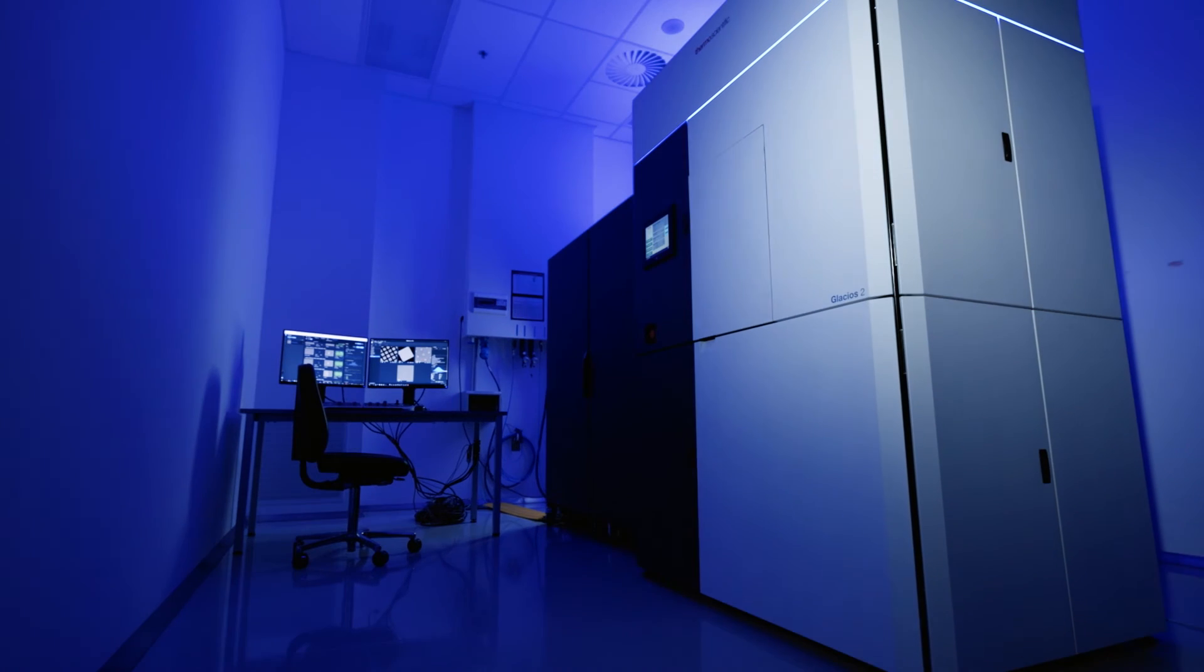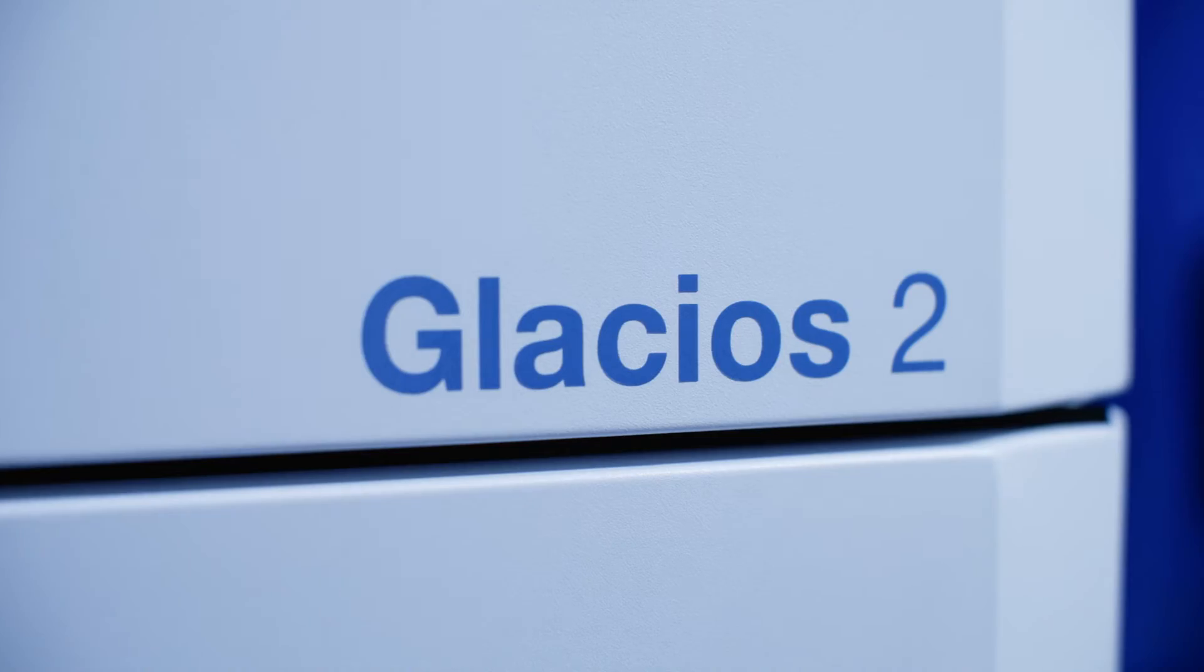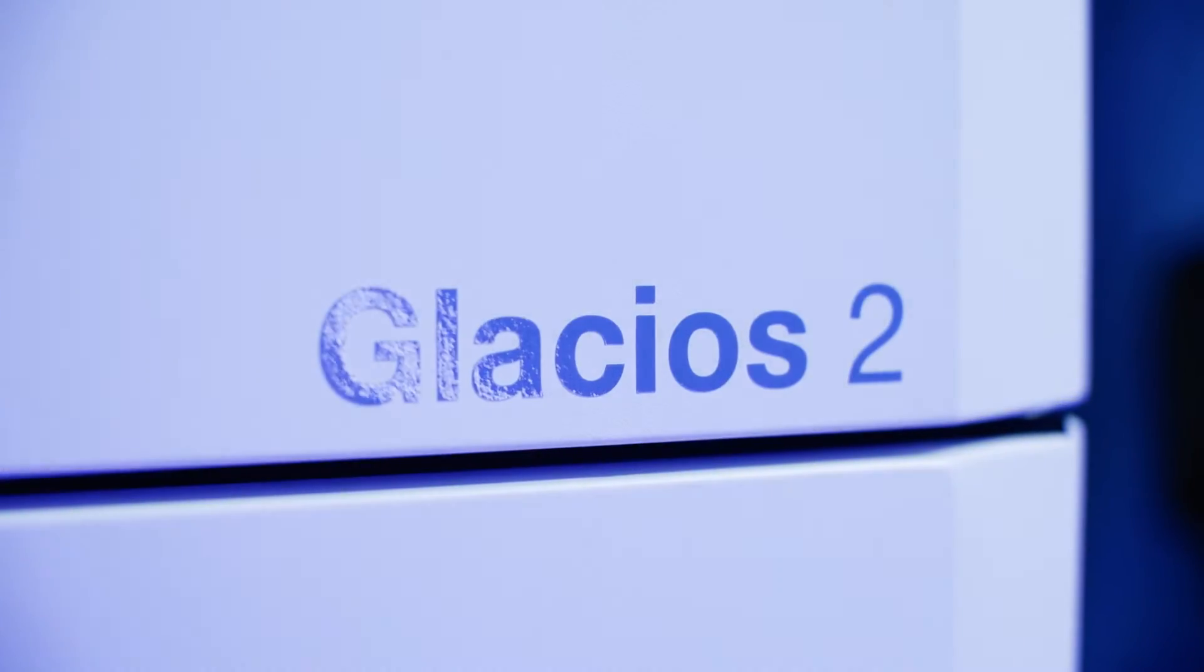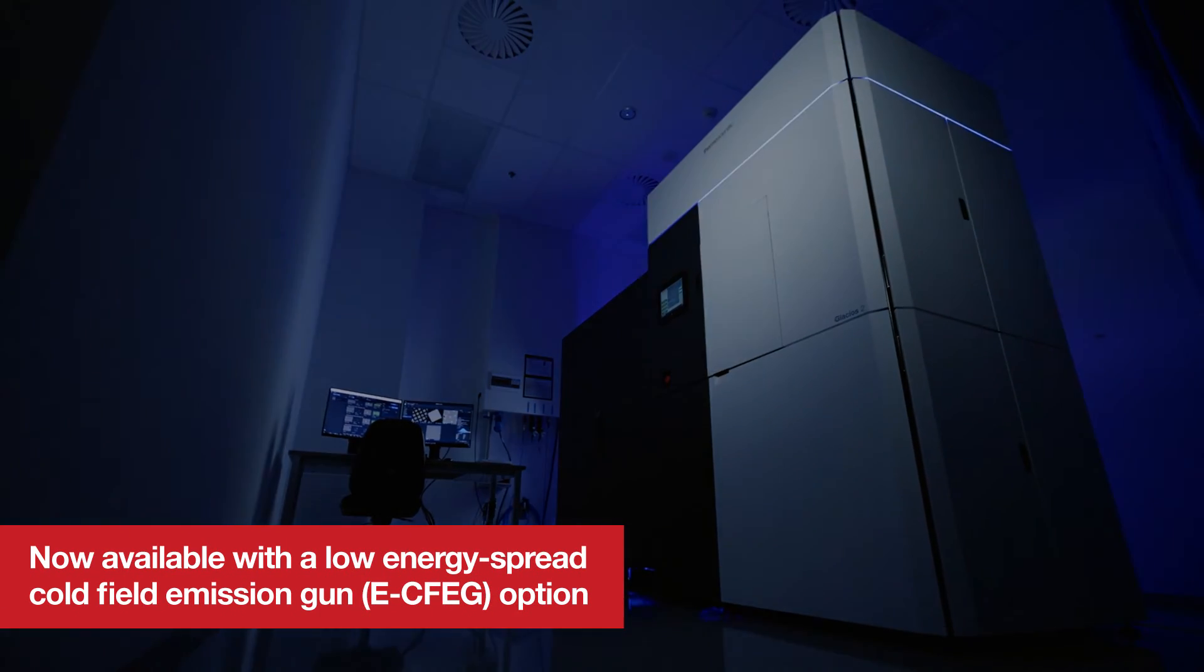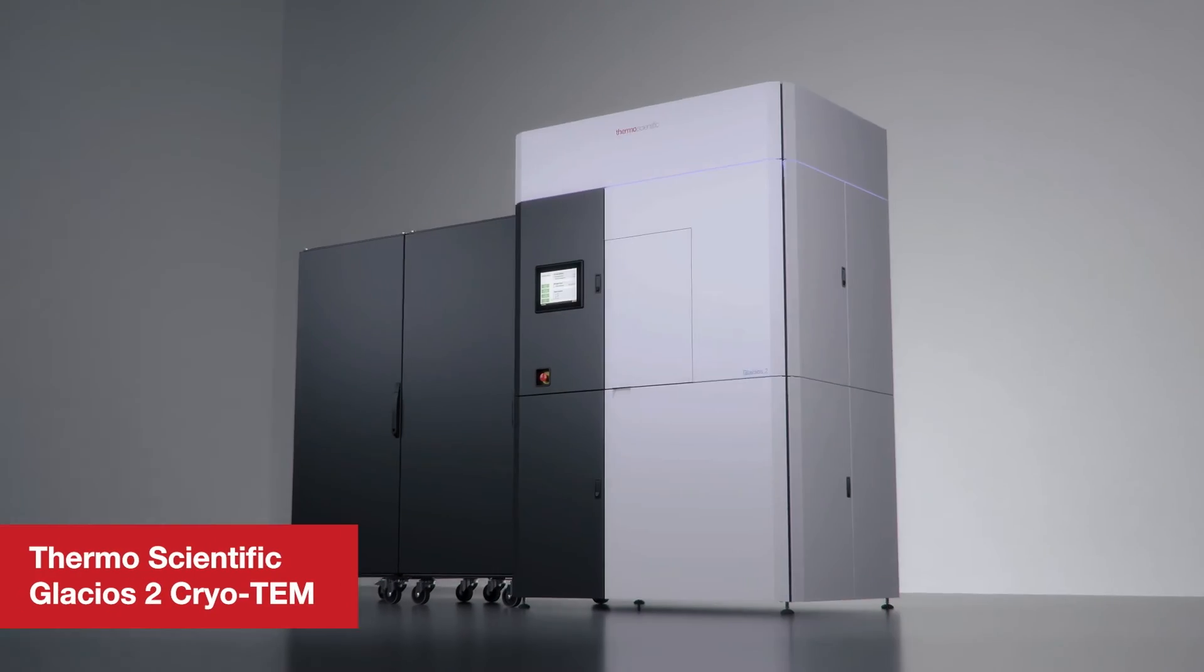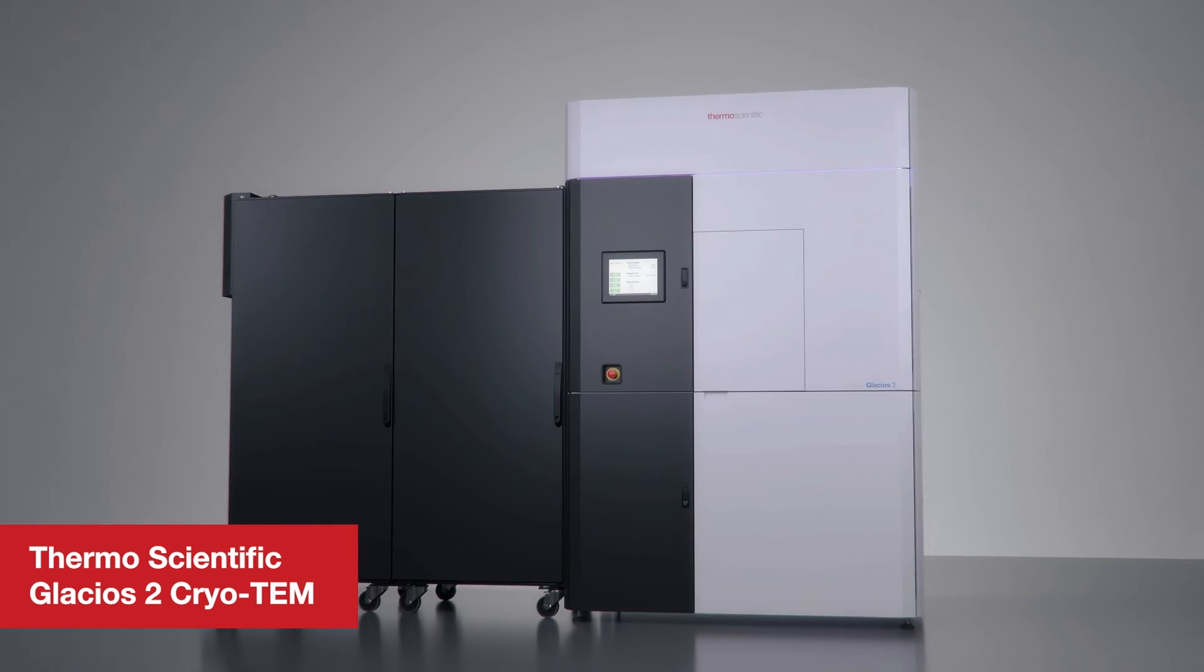The Glacios II CryoTEM combines years of technological advances and innovations designed to make cryo-EM more accessible. Enhance your cryo-EM imaging with the Glacios II Cryo Transmission Electron Microscope.